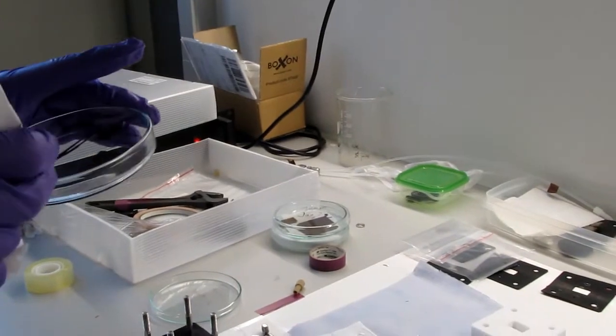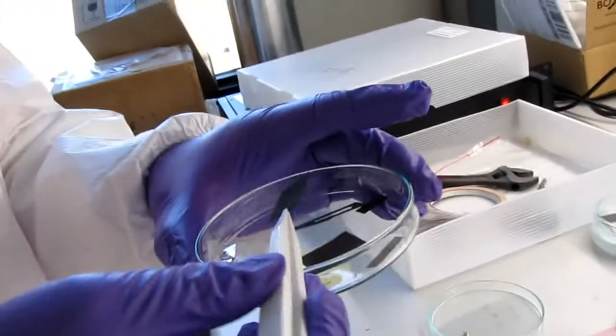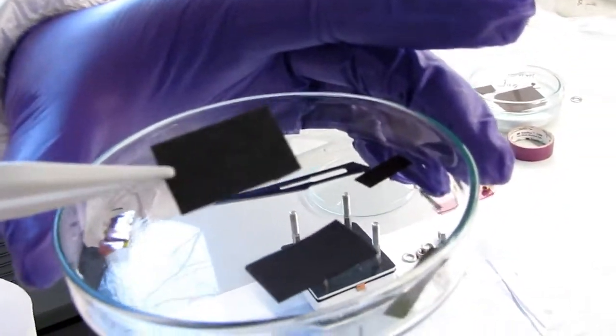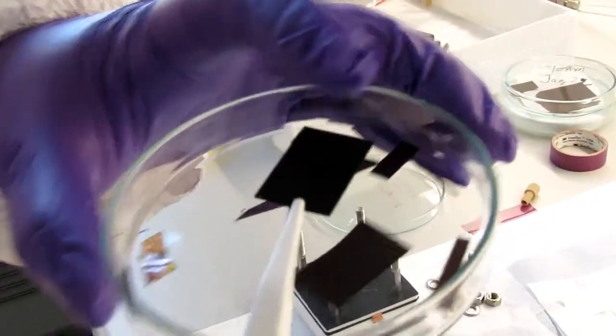This is a blank GDE electrode. GDE, the full name is called the gas diffusion electrode. Basically, it's some carbon fiber, you can see. We coated on this side. This is the microporous side.